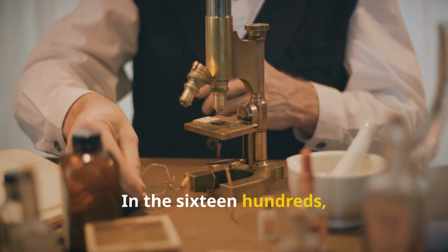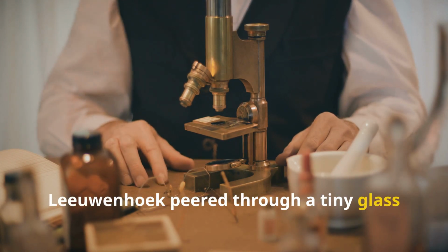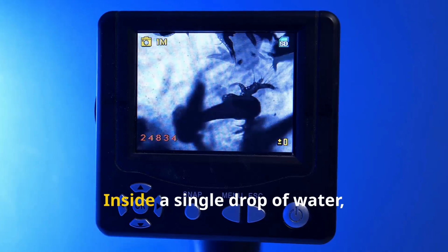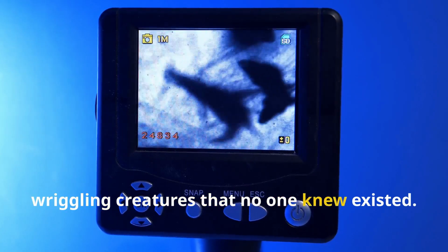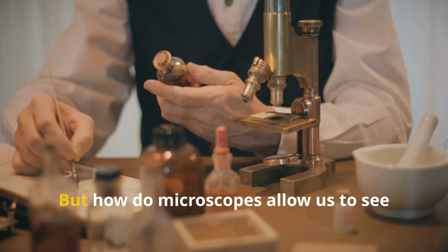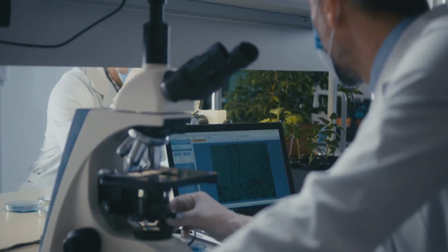In the 1600s, a Dutch scientist named Antony van Leeuwenhoek peered through a tiny glass lens and made a shocking discovery: an entire hidden world teeming with life. Inside a single drop of water, he saw tiny, wriggling creatures that no one knew existed. This moment changed science forever, proving that the unseen could be explored. But how do microscopes allow us to see what was once invisible?